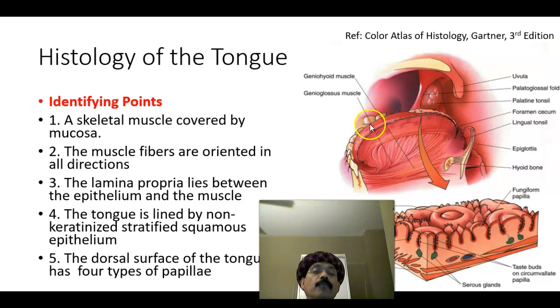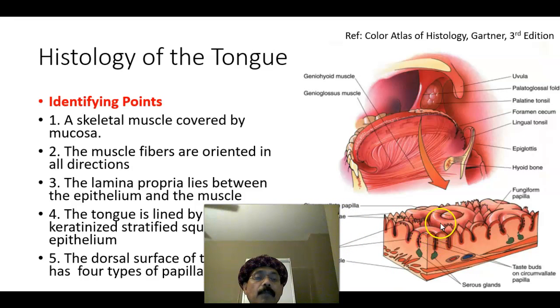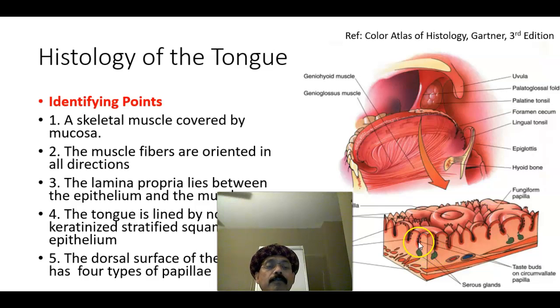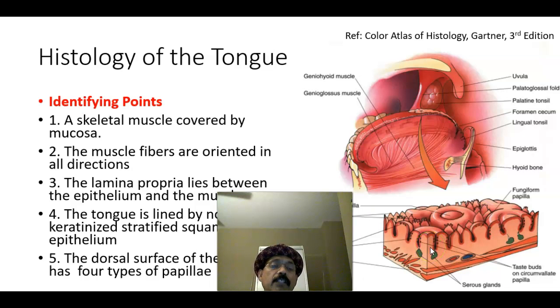The dorsal surface of the tongue has four types of papillae: the circumvallate papillae, the fungiform papillae, the filiform papillae, and the foliate papillae, which are on the side of the tongue and not shown here. We also have serous glands called von Ebner's glands present in the lamina propria, which secrete into the furrow of the circumvallate papillae. We have plenty of blood vessels — arteries and veins — as well as nerves connected to the muscle and the taste buds.